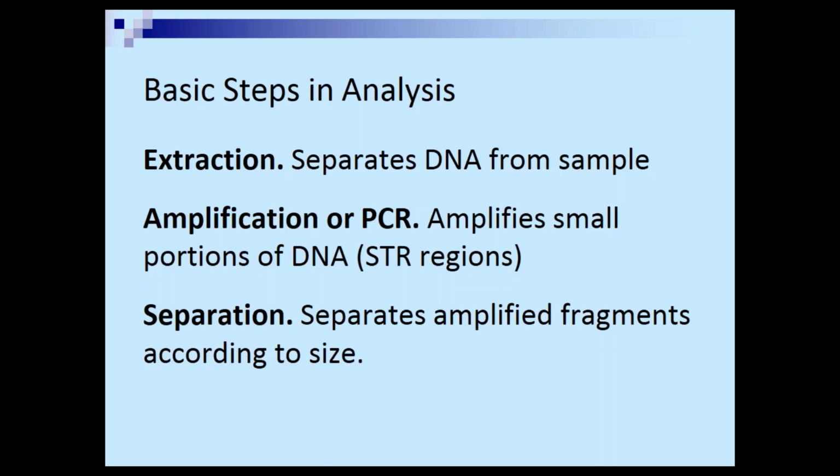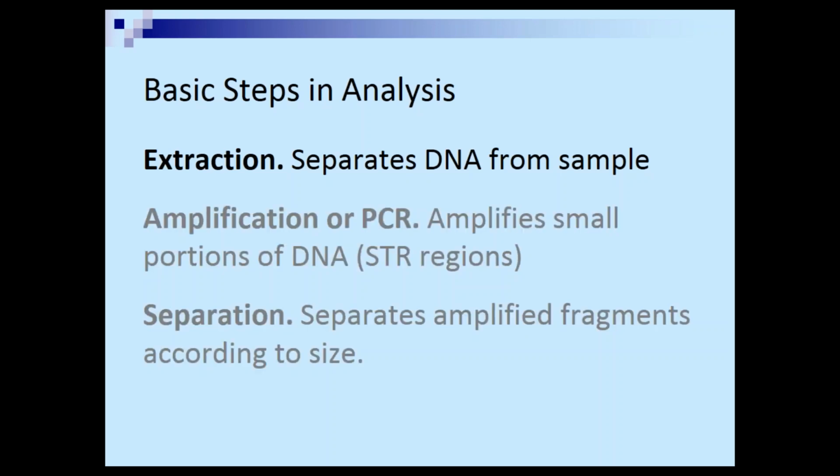Okay. Now, I want you to think of all the stuff that's done in the lab as a 3-step process, okay? And we can see them here: extraction, amplification, separation. All right. Extraction is the first part, and again, we're not going to go into a lot of detail in JS110. This is something that we go into a lot more detail in JS352.